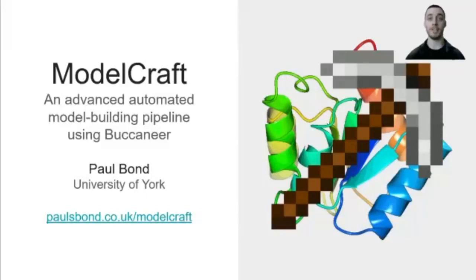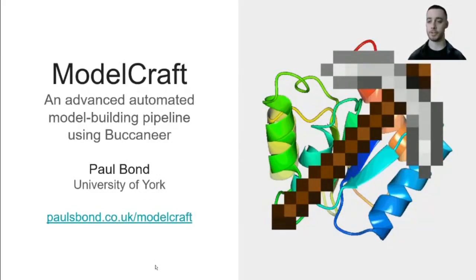Yes. Hi everyone, I'm Paul Bond. I'm a postdoc at the University of York working for Kevin Cowtan, and I'm going to give a presentation on ModelCraft, which is our new automated model building pipeline that uses Buccaneer and lots of other programs. There's a website you can go to here. It's got more information on how you can install and use ModelCraft, but I'm just going to give a bit of an introduction.